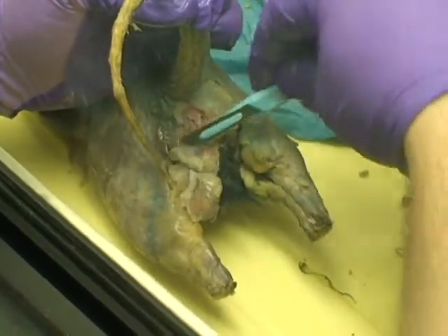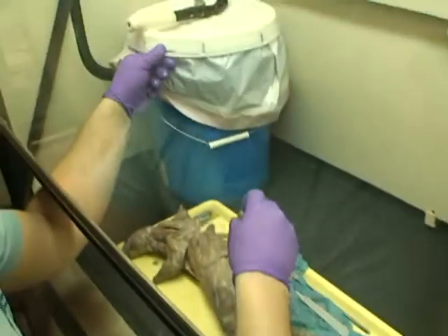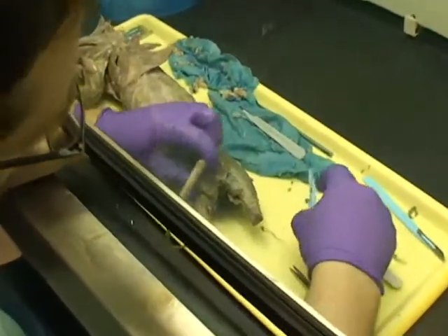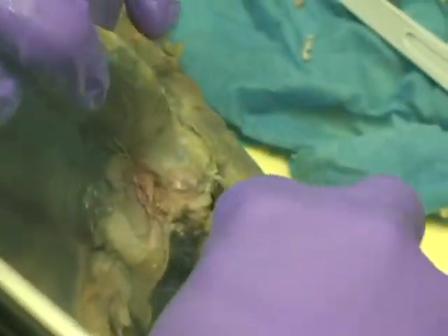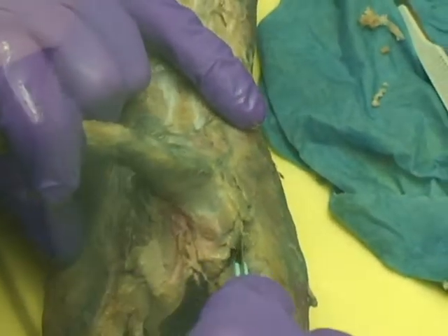If your scalpel's dull, trade it for a good one before you start. Put it in the ammo waste bin that's in here — don't take it out of the hood at all.